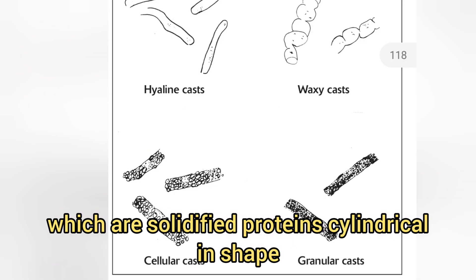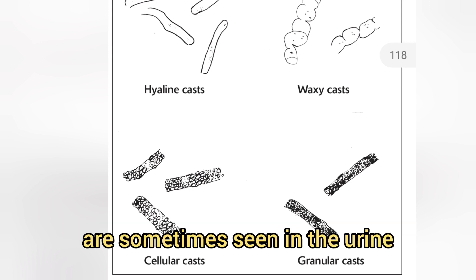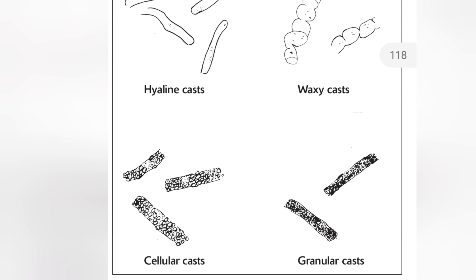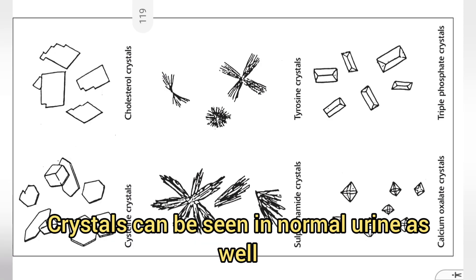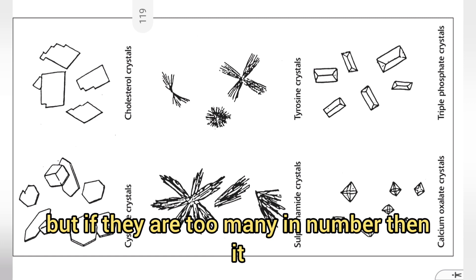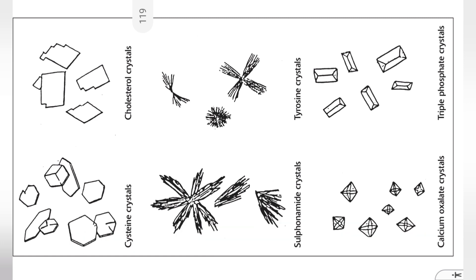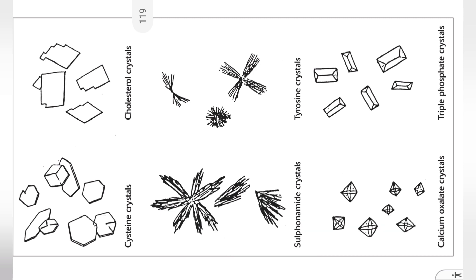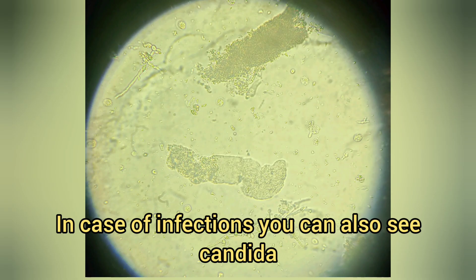Casts are solidified proteins, cylindrical in shape, and you can see them at 10x as well. They are sometimes seen in urine, and if you can identify them, that is very good. Crystals can be seen in normal urine as well, but if they are too many in number, it might indicate some kind of pathology that the doctor can correlate with clinical findings — like stones or metabolic disorders.